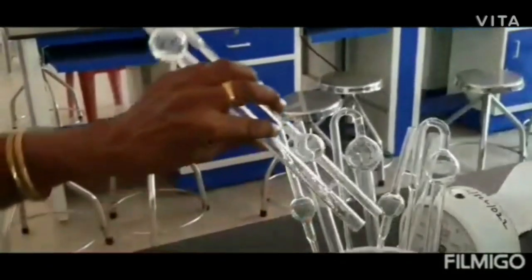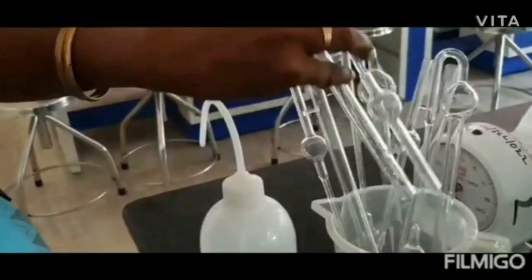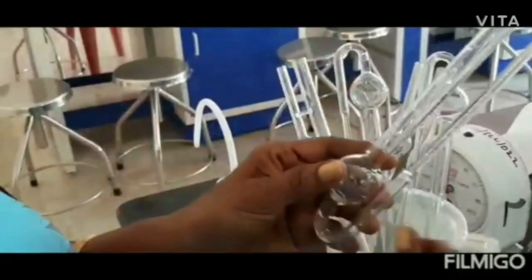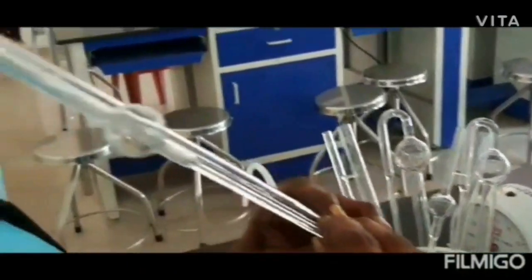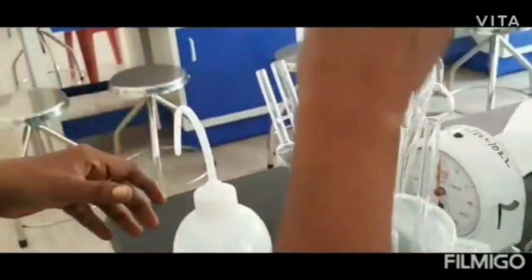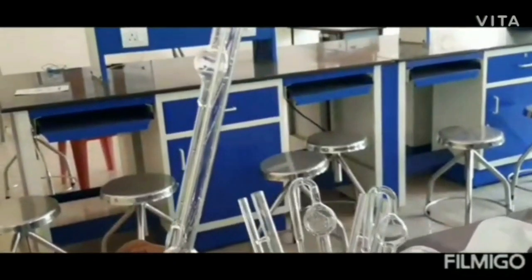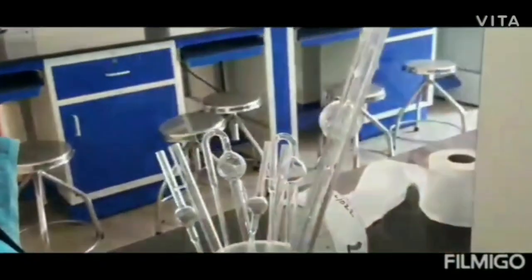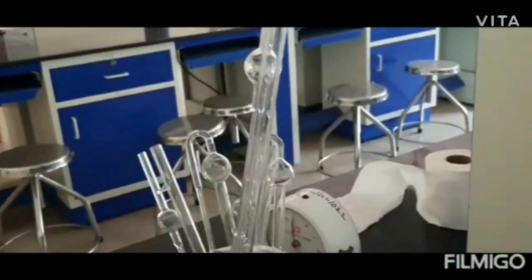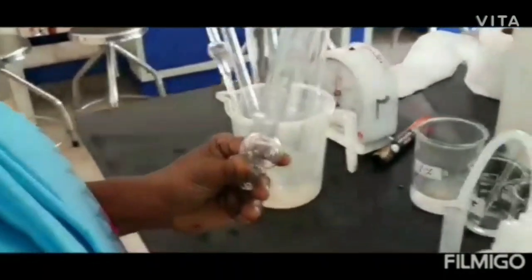Just ensure that there are no bubbles inside the viscometer, especially in the capillary tube. If you find any bubbles, we have to blow and drain them out of the viscometer. When it is thoroughly cleaned with distilled water, now just measure 10 ml of the distilled water.